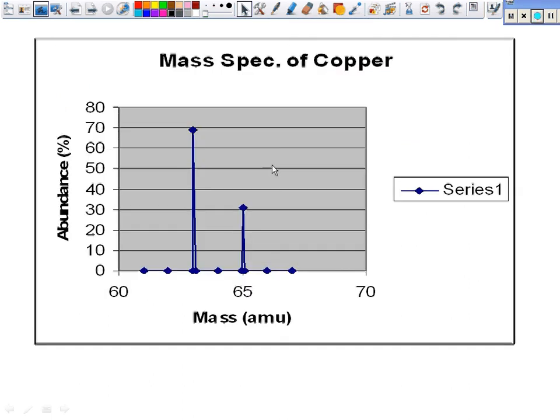This is an actual diagram of a mass spec reading. Some of the things you're going to have to learn how to do is read your graphs. You have to look at the X and Y axis. What is the y-axis telling me? Percent abundance. What does percent abundance mean in basic terms? Yeah, if I walk outside and start digging it up, how often will I find it out of 100 of them? Okay. Mass, we get.